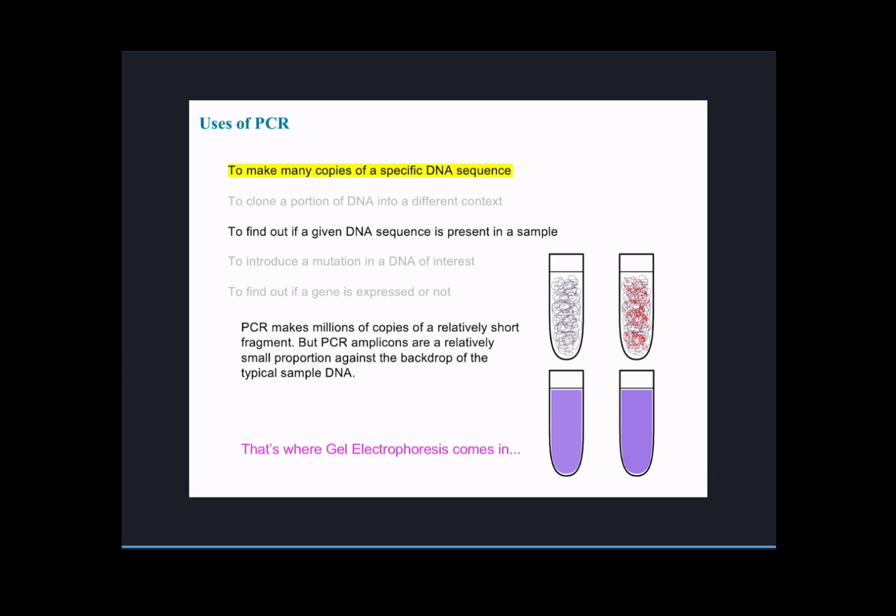So the question that we ask is, is there DNA in my sample after the PCR? We'll always see DNA. Now, if we ask, are there many copies of a fragment that is of this particular size that I know I should get if the PCR worked, then the answer to that question is much more meaningful. So how do we determine what may be the size of different fragments of DNA present in a sample? And that's where gel electrophoresis comes in.